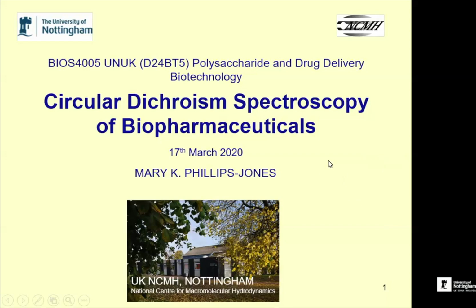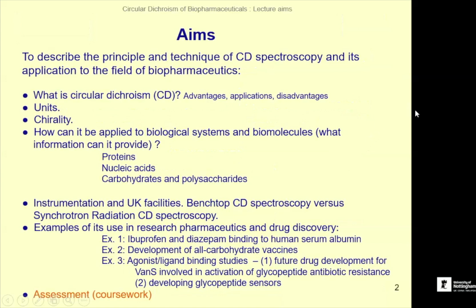So for the next hour or so, I'm going to talk about CD spectroscopy for biopharmaceuticals, as you already realise. And I'm hovering near here just so that I can coordinate the recording at the same time with the cursor. Okay. So what am I going to talk about?